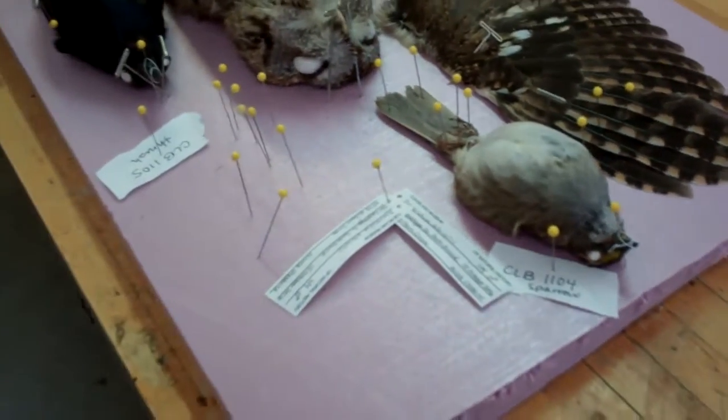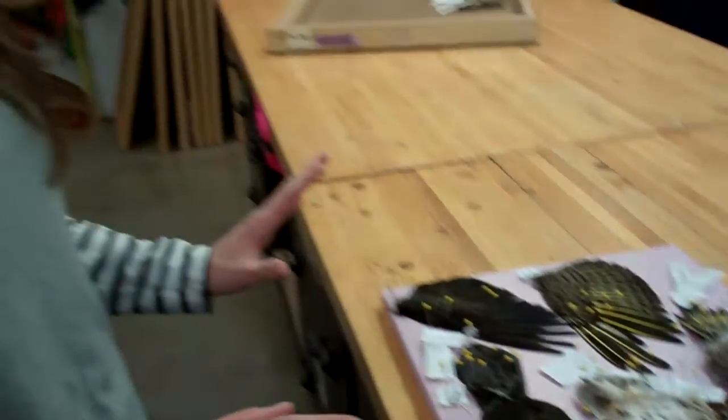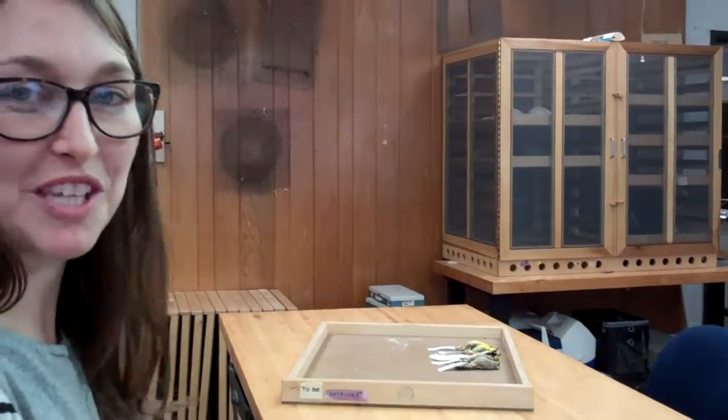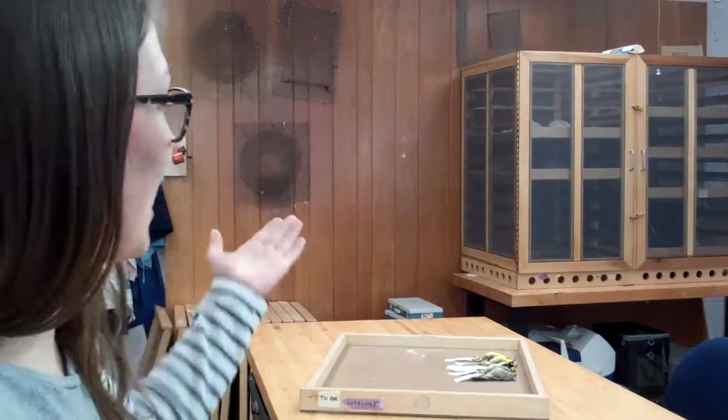We just pin them in the position we want them to stay and just leave them in this awesome drying rack built by one of our museum carpenters. They'll just hang out in the drying rack for about a week if it's a small bird, a few weeks if it's a larger bird, until the skin is fully dried.